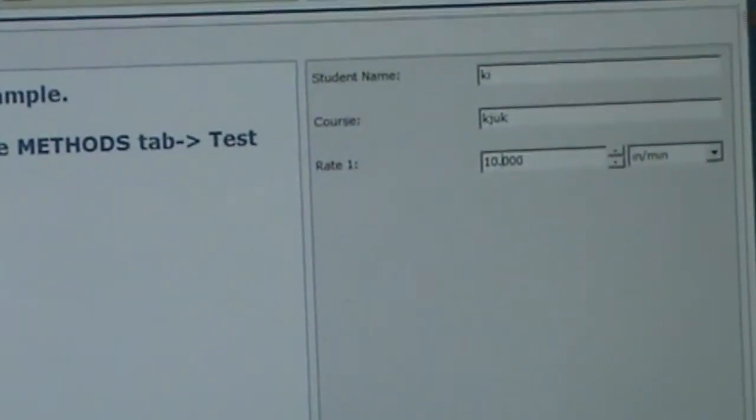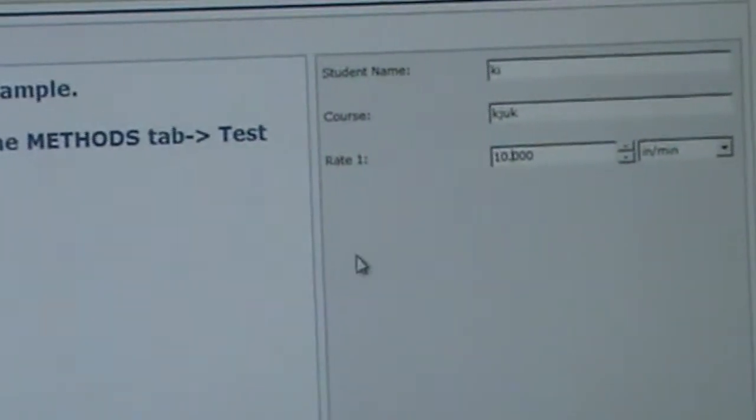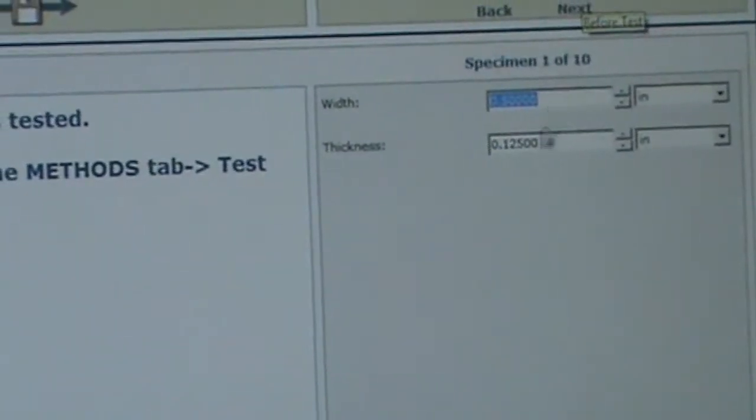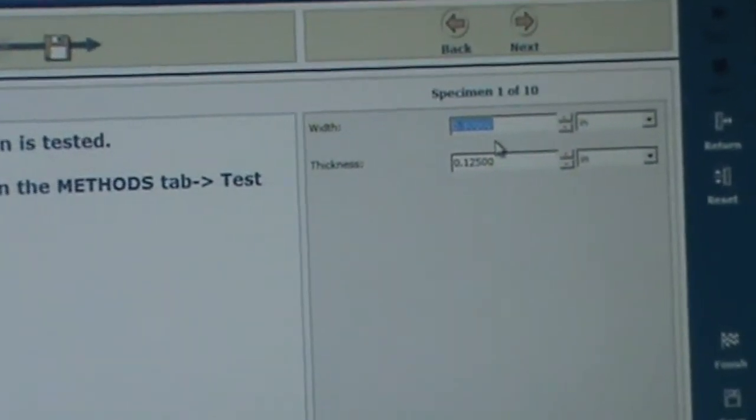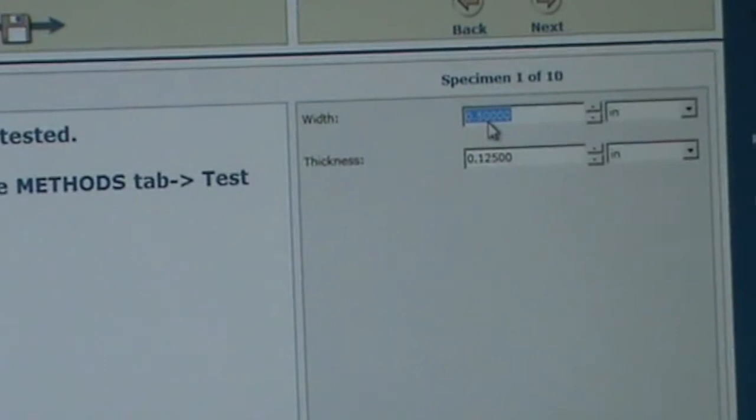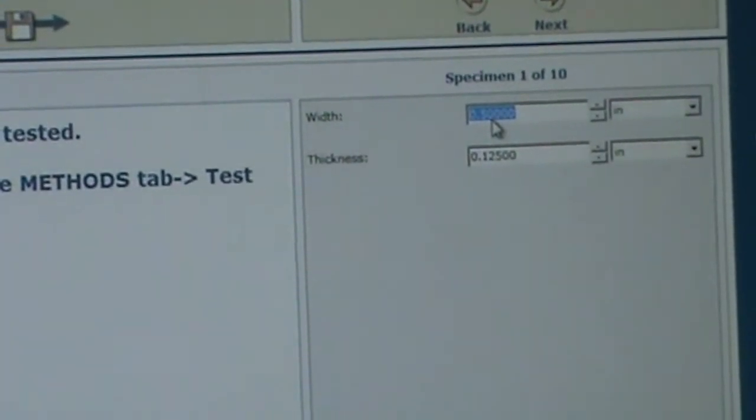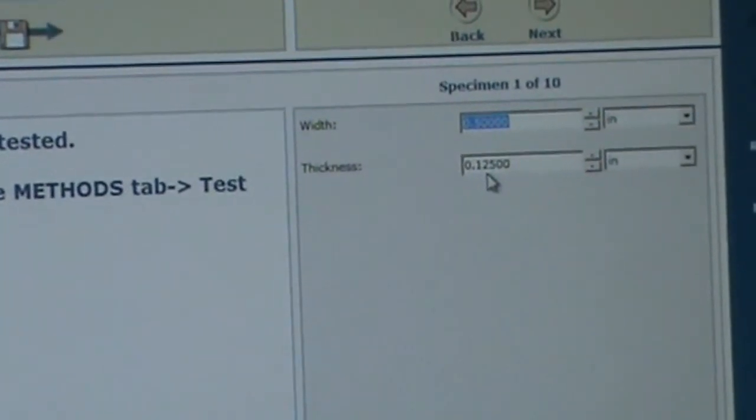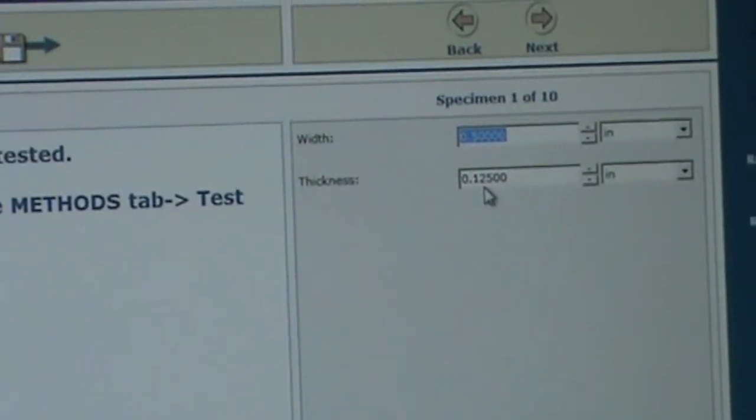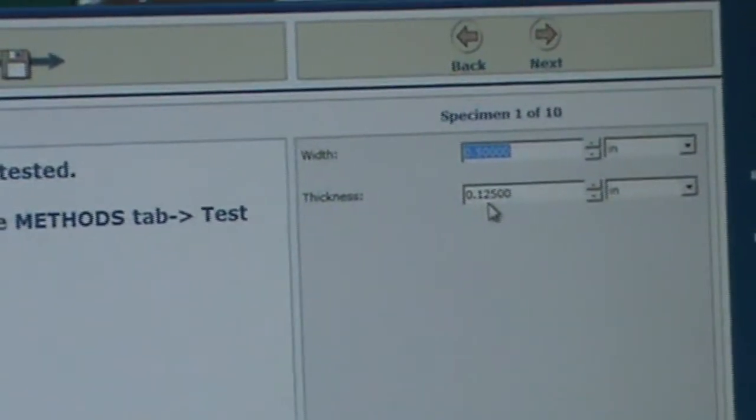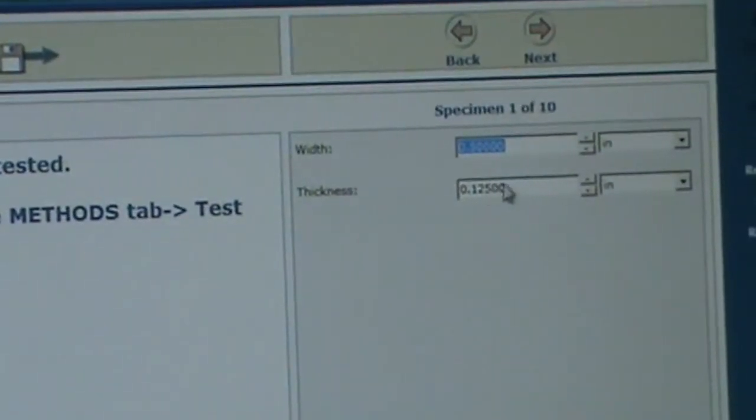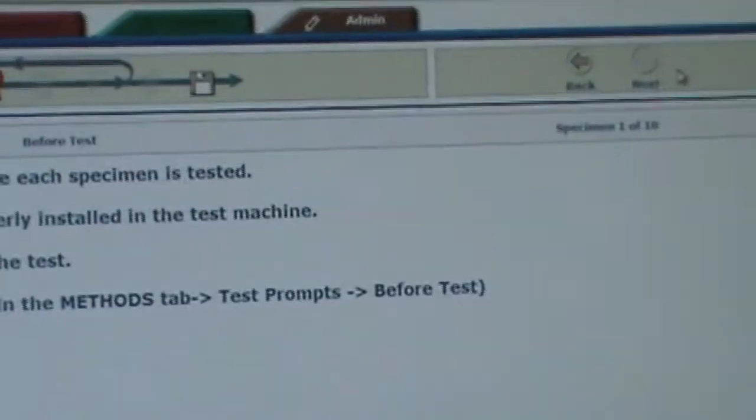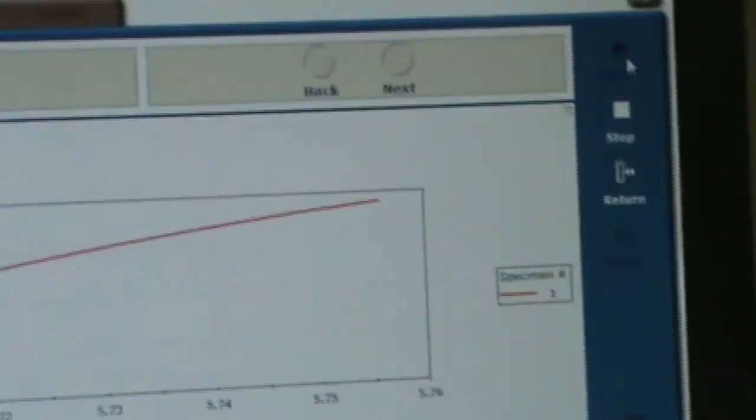Now, we're going to come up here and go to next. This is where you enter in the values you measured on your specimen. So it should be at .5 width. And the thickness should be at .125, someplace in that area. So we're ready to go. Now, I'm going to come up here and go to next. And then come over here to start. Now it's running.